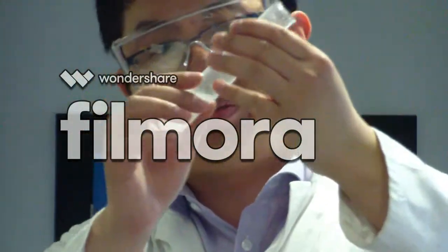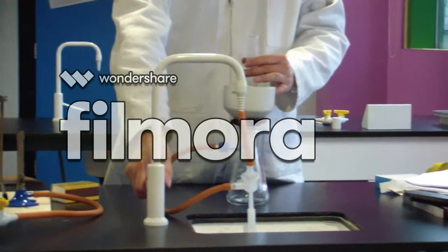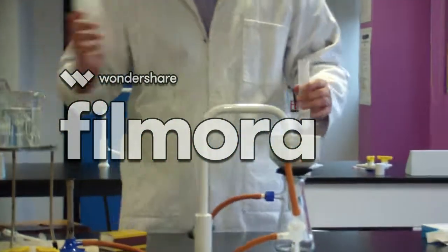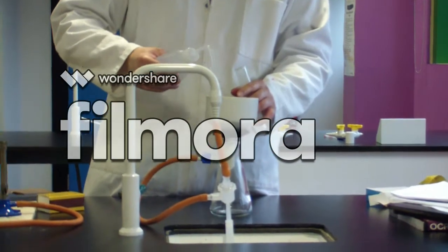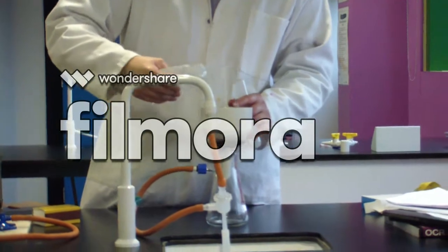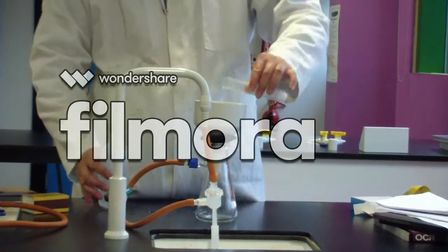And now you just need to vacuum filtrate. So, the same process as before, we turn on the water. We wet the filter paper in order to create a vacuum seal. And once that's done, you can just pour it in. And now we just clean it with more water.